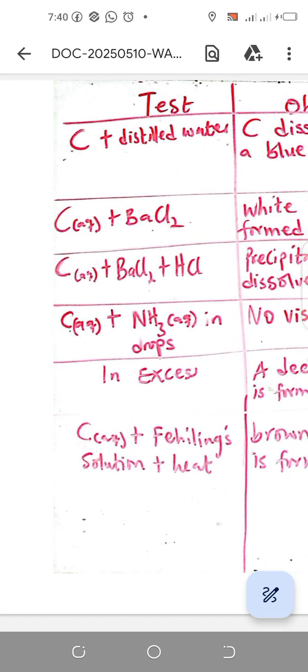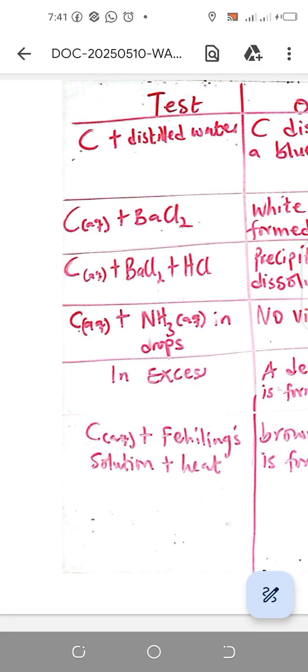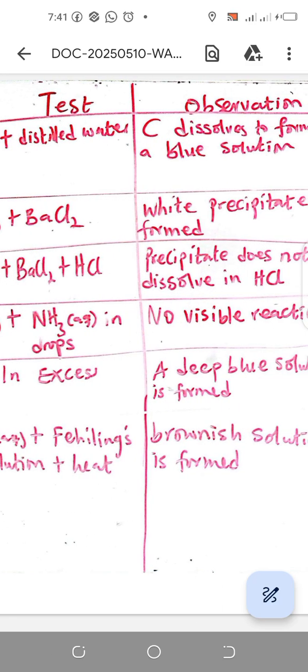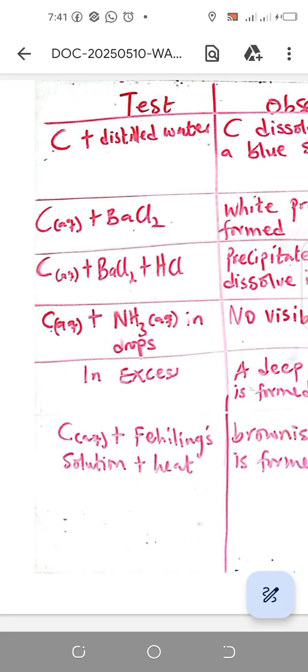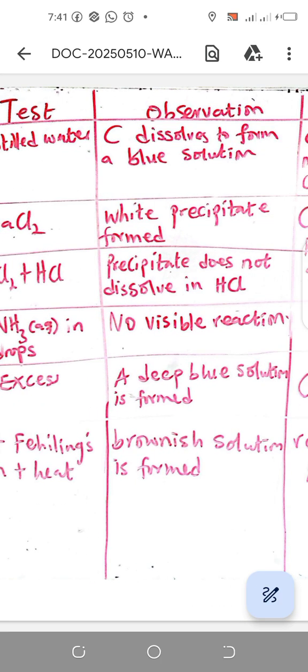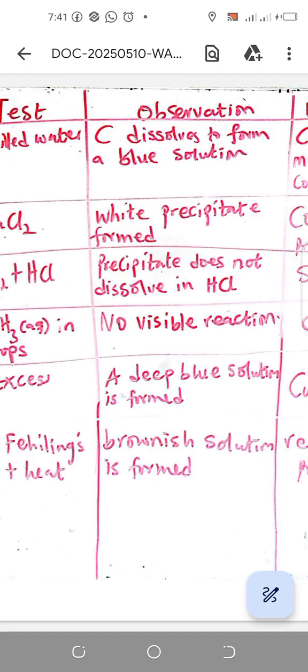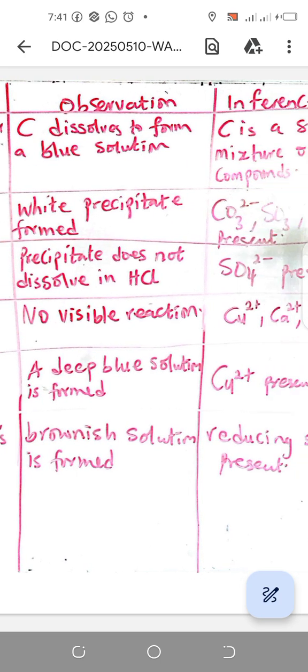For the last test here, you have the Fehling's solution where you have Fehling's A and B added to the aqueous C. You can heat that solution, and you see a brownish solution from that, which confirms a reducing sugar in the mixture.